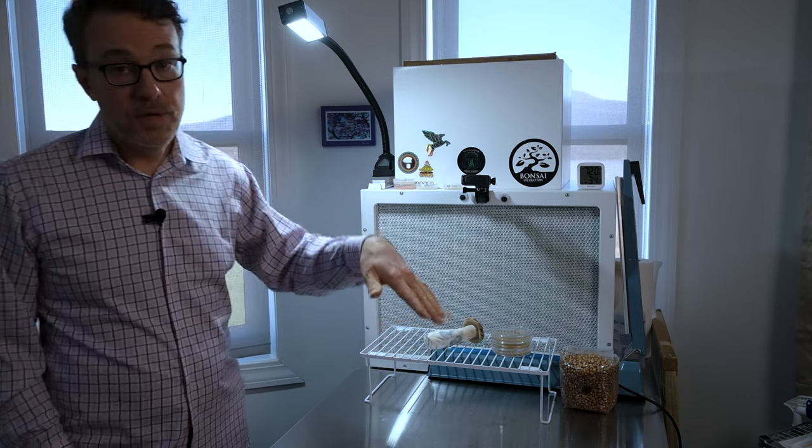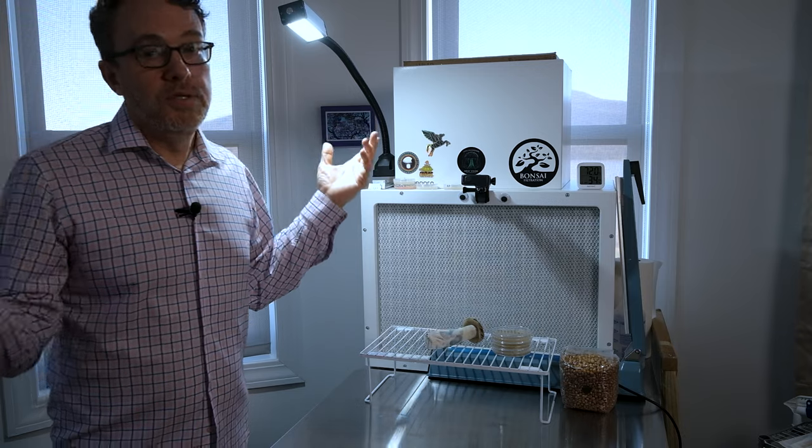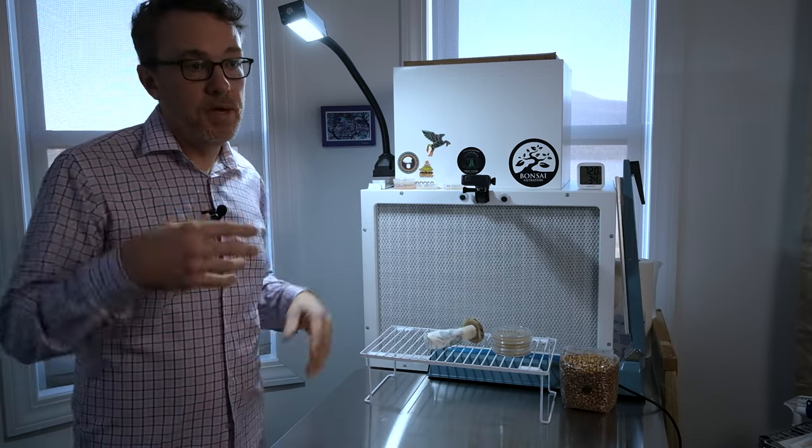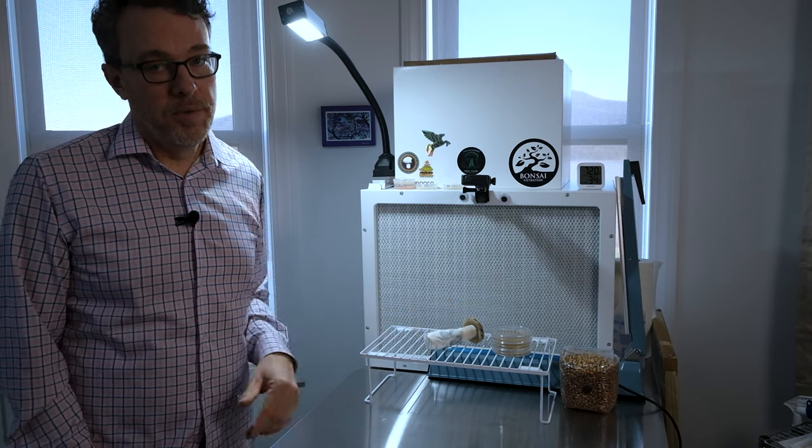A clean workspace is the foundation of any successful mycology work. We're going to have open agar plates and petri dishes exposed to air, so we want to minimize contamination. Close all your windows and turn off any fans circulating air near your workspace — there are a lot of airborne contaminants floating around. Let those settle, then wipe surfaces. While you wait, take a shower, put on clean clothes, since molds, spores, and bacteria stick to us throughout the day.